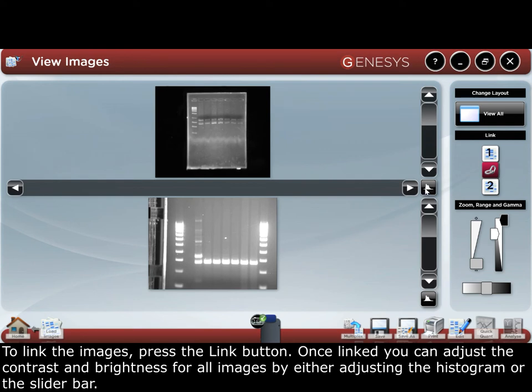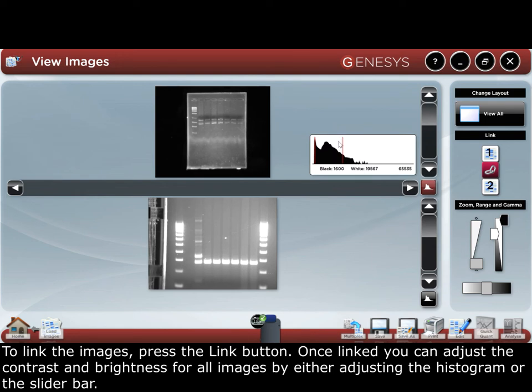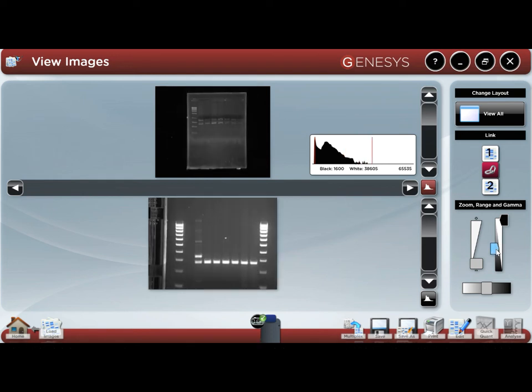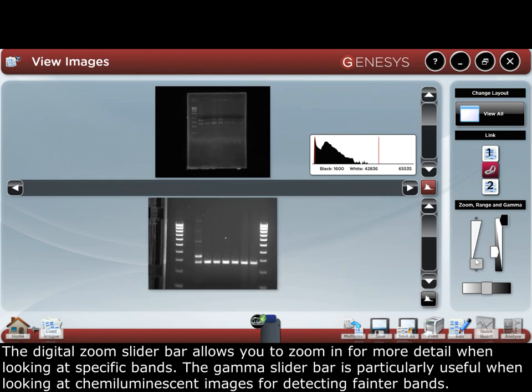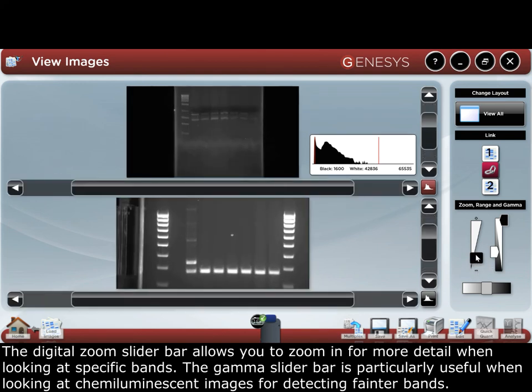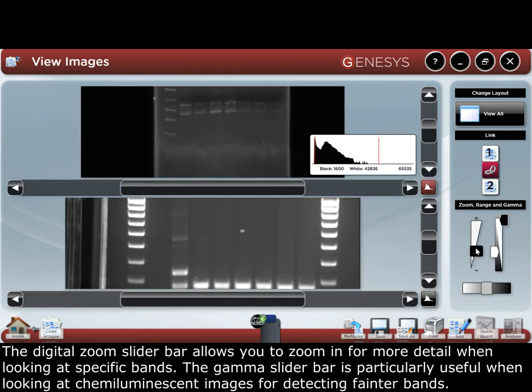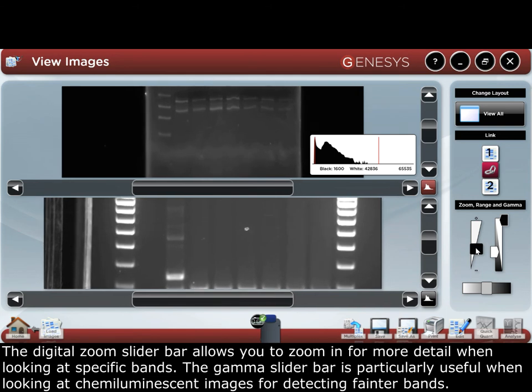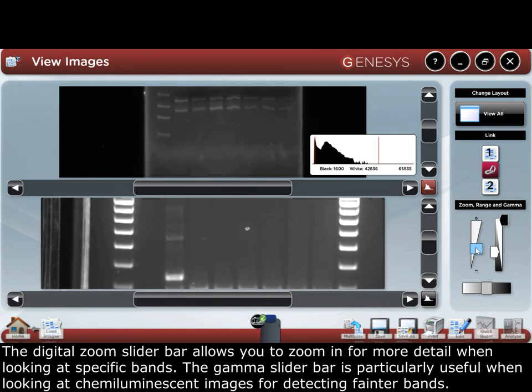Adjust the contrast and brightness by either adjusting the histogram or the slider bar. The digital zoom slider bar allows you to zoom in for more detail when looking at specific bands. The gamma slider bar is particularly useful when looking at fluorescent images for detecting fainter bands.